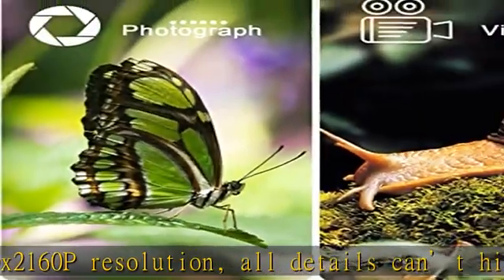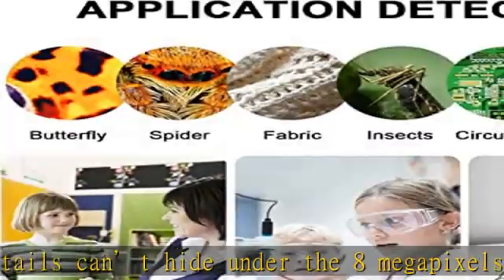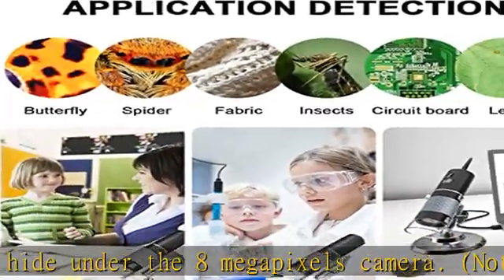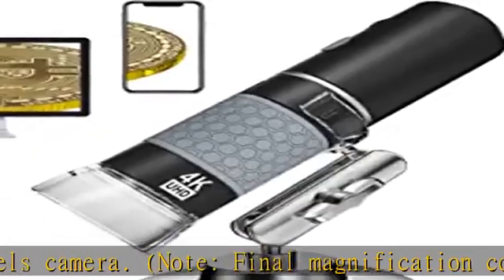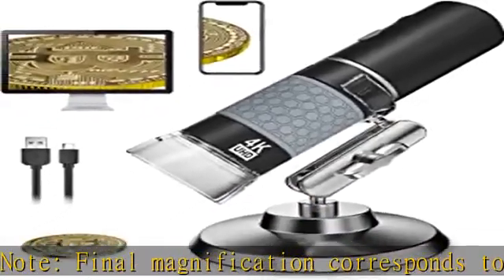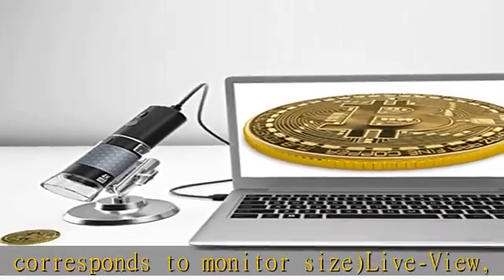Live view — zoom in/out, capture images, and record videos. Once the microscope is connected to the phone or PC, you can enjoy the clear microscopic world on screen. Zoom in/out and taking an image or video is as simple as tapping the image/video button on your device or pressing the related app trigger. Note: zoom in/out doesn't work on PC.